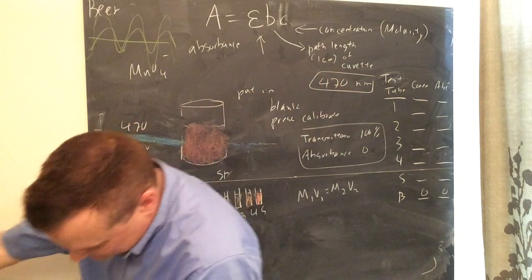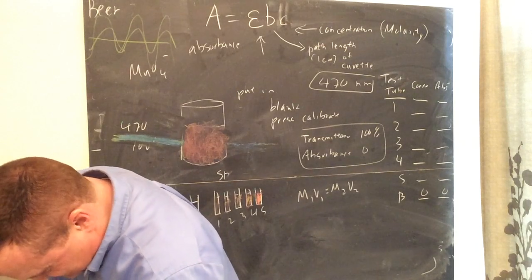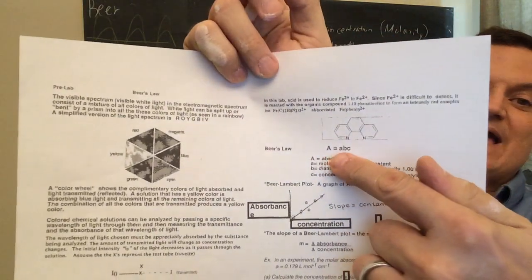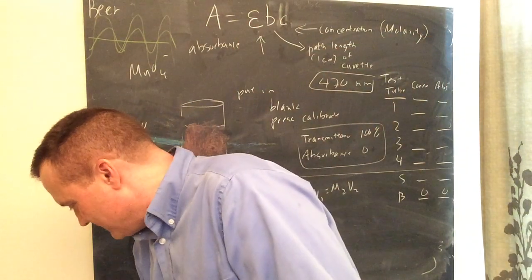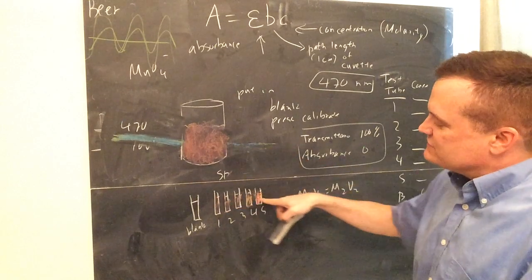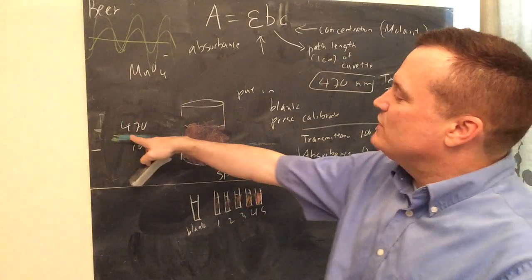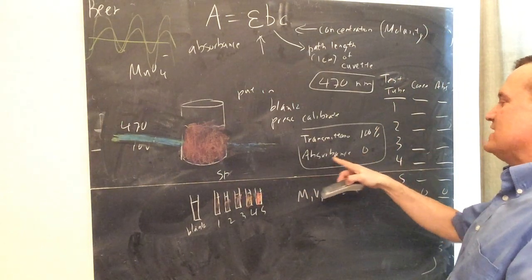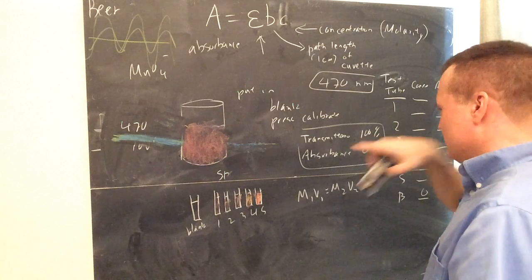All right, so let me go back to my first page. Is there anything here I want to show you? Yes, okay. I got to go back to this one now about Beer's law. Now, this one says A equals epsilon bc, but now they use epsilon instead of the small a. I guess having 2 A's was too much of a confusion here. So I'm going to measure 5 different reddish-orange solutions. One of them is very, very weak and light, small molarity. One is very dark, high molarity. I'm going to always put in the same color of light and see how much gets through. Really I only care about absorbance, which is a logarithm of the fraction that gets through. So you saw that from the formula on the first page.